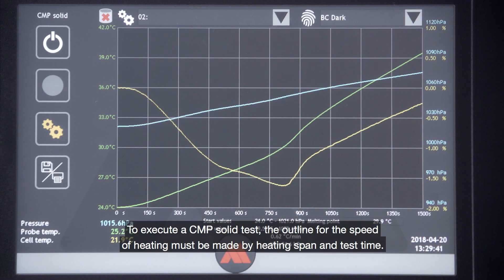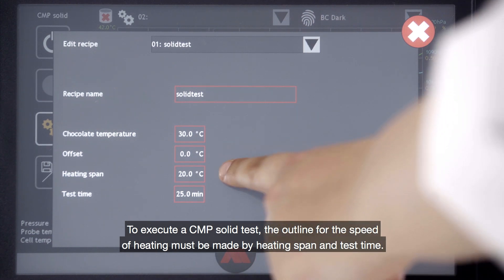To execute a CMP solid test, the outline for the speed of heating must be made by heating span and test time.